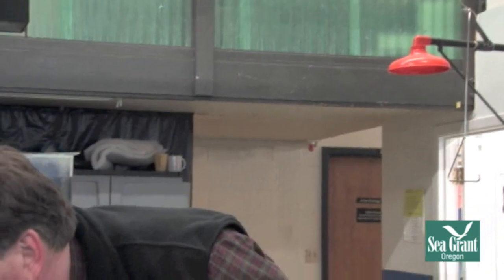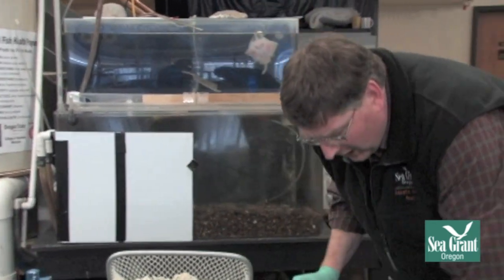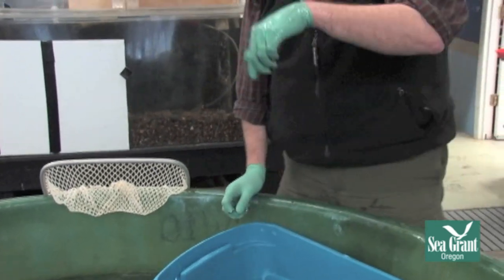The other thing I do really quickly is come in and do a gill biopsy on the fish right away and put it on the same slide.